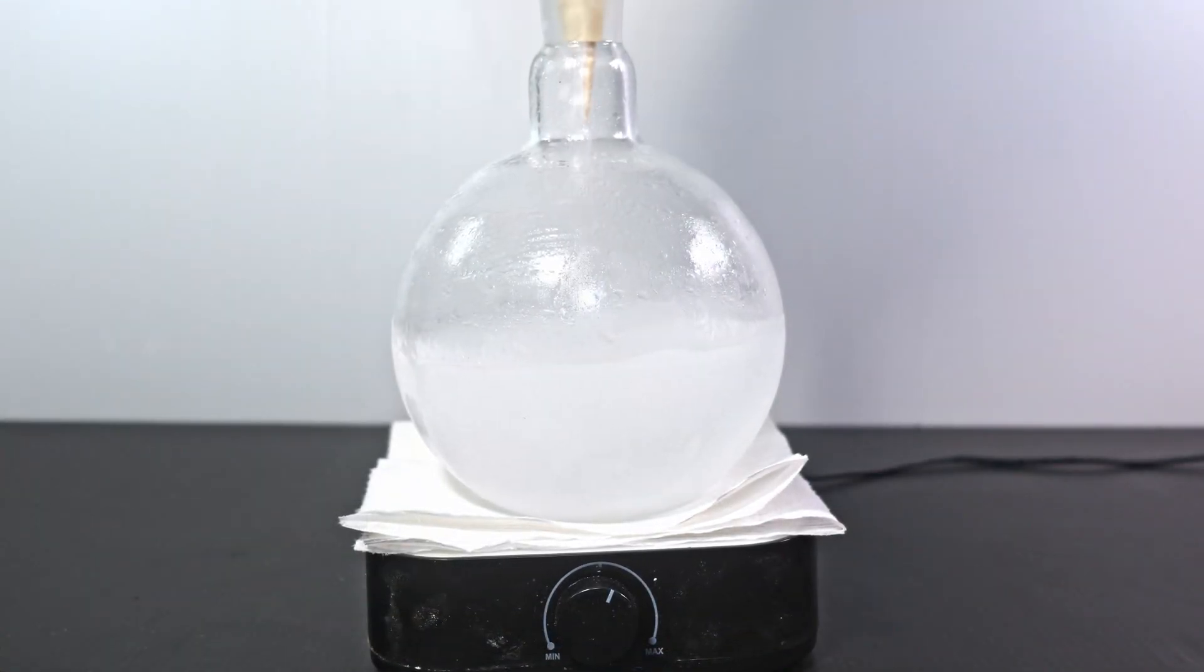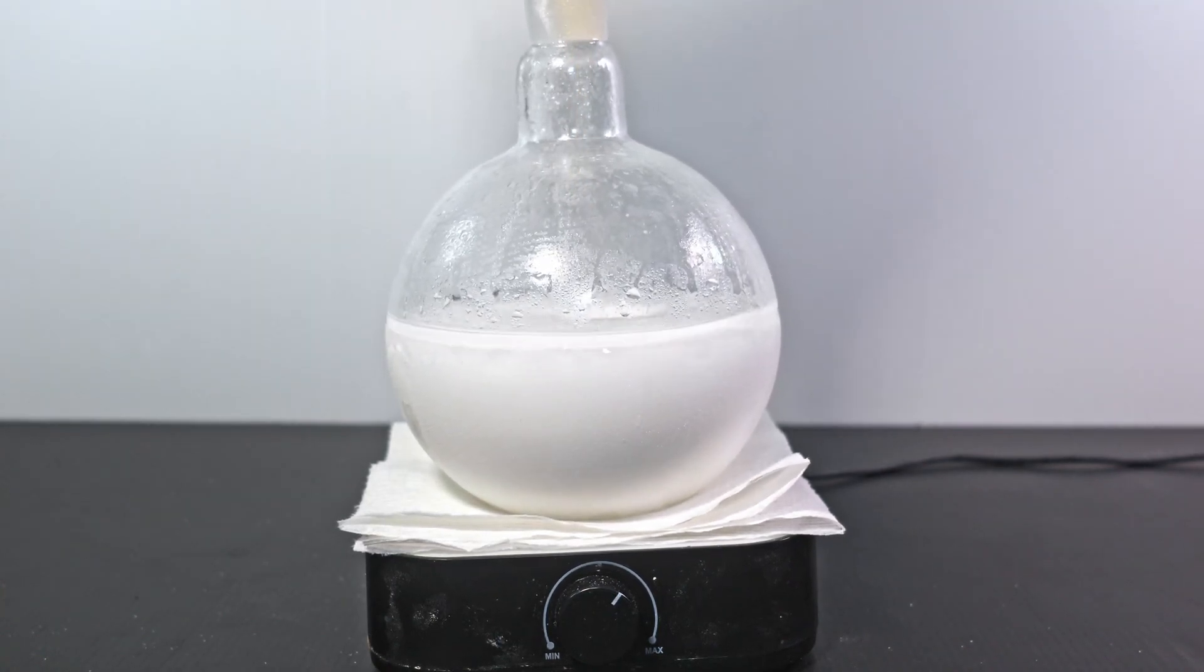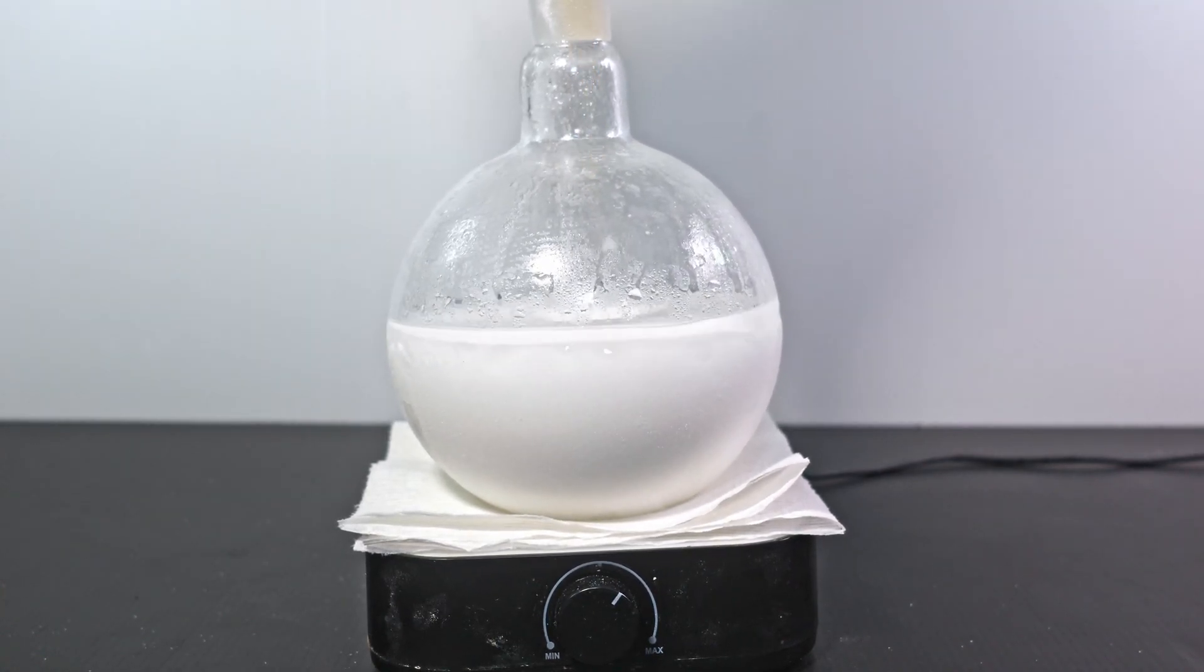Once I get it stirring, I start to add in my sodium bromide. It is important to have the stirring high so the sodium bromide does not settle which will seize the whole mixture and significantly decrease the rate of reaction.